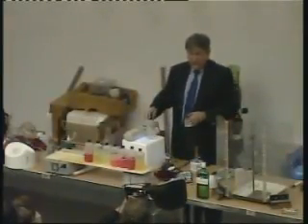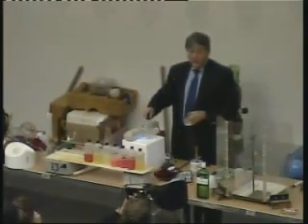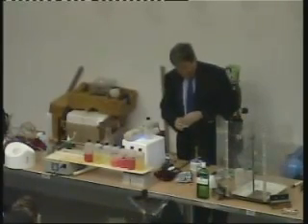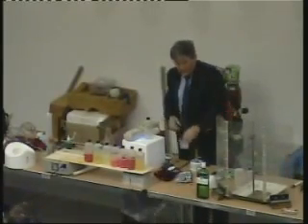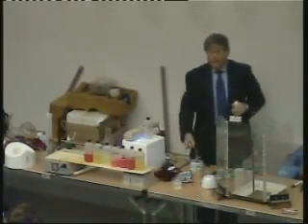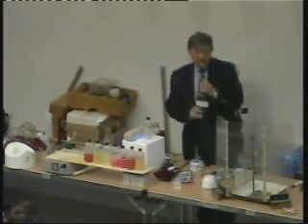It would give me cancer, diphenylanthracene, and the solvent is methanol, which would turn me blind and stupid, or more stupid. Quite happy to drink this, but if you will forgive me indulging myself, I'm going to call that solution T, and I'm going to add to it a little solution G.